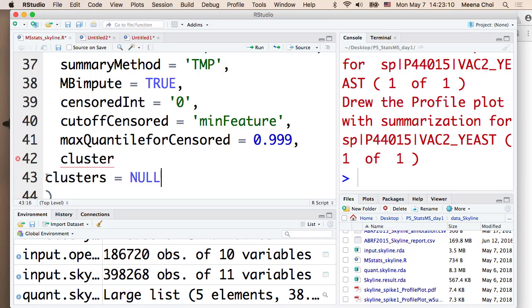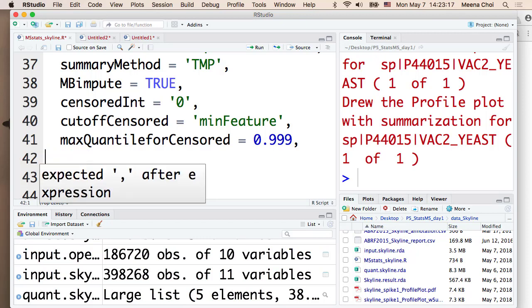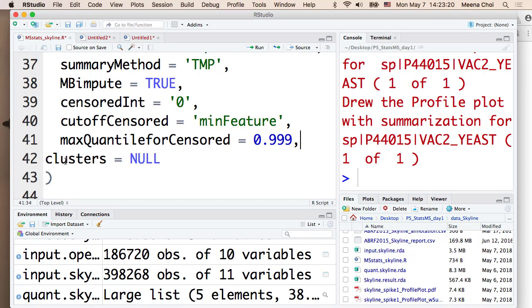That is only for people who have the 11.7 version from the TA. Otherwise, don't change this. So people who have a cluster issue and reinstall it, please put this option over there. This means that we can only use a single process to run? Yes. So I tried to find what the problem is with the cluster. Most likely it looked like some firewall or security issue, but so far I don't have a solution. So I just made a different version to not use the cluster and it works.